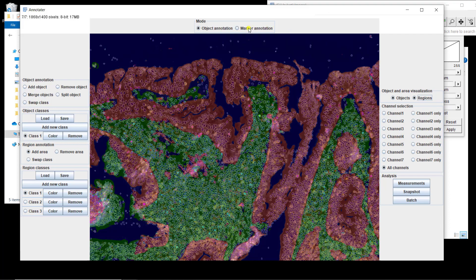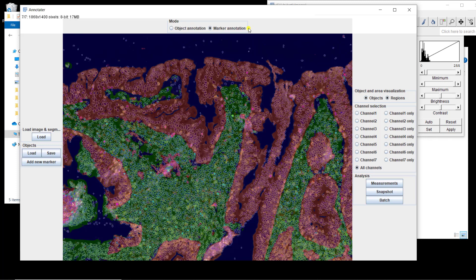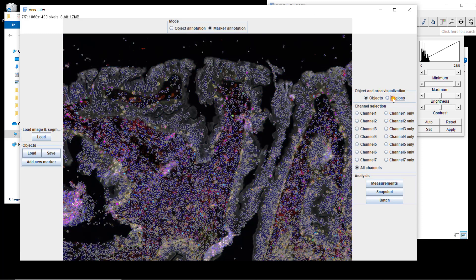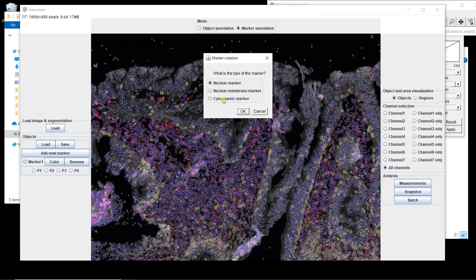Now we can try to associate markers with nuclei. We change the mode on top from 'Object Annotation' to 'Marker Annotation'. We still have the same right panel. Since we're interested in markers, we don't need the regions anymore, so I'm going to get rid of them. Then we can add new markers. Let's add a new marker — a window pops up asking which kind of marker: nuclear, nuclear membrane, or cytoplasmic.